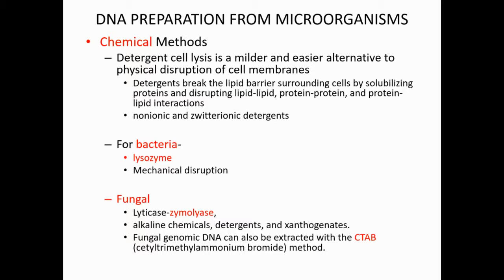And the ionic detergents, like SDS, are strong solubilizing agents. They can denature the protein and destroy the protein activity and function.